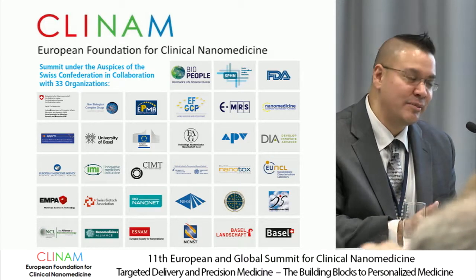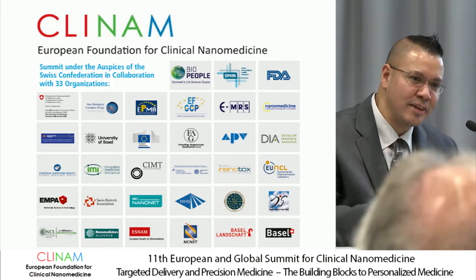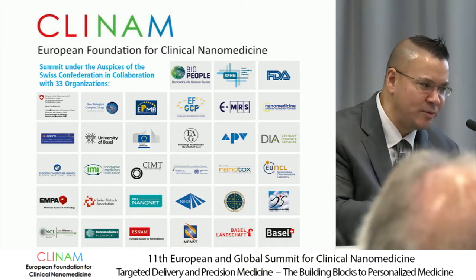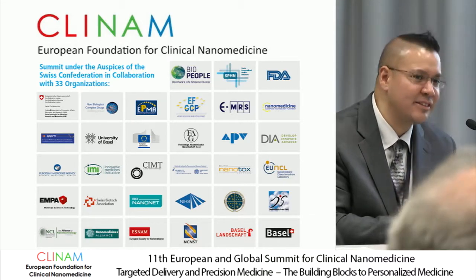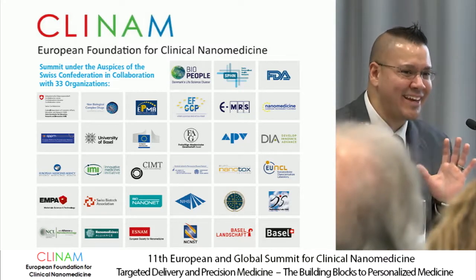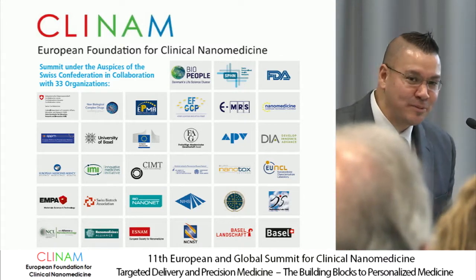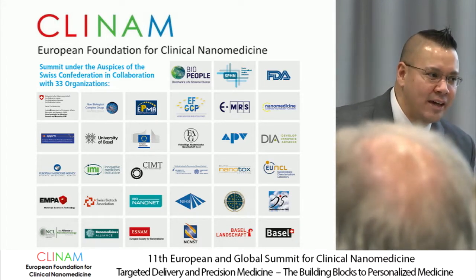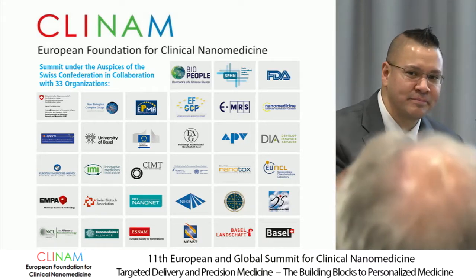And that kind of leads to my question then, so if that's the case, you have all these techniques coming out there, right, where you can say, I have 5, 6, 7 nanometer, 1 nanometer resolution. How important is that, though, in a biological context, right? Now, depending what your background is, you can debate that heavily, right? Depending on what you're doing. So, and I'll leave that to the group as well to discuss that aspect. How important is that resolution and sizing techniques as it relates to a biological context then?